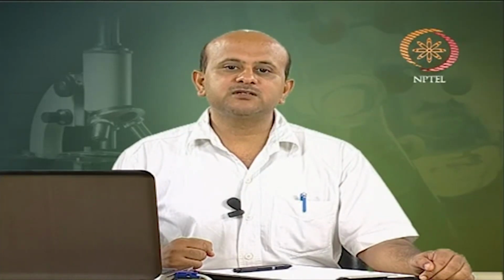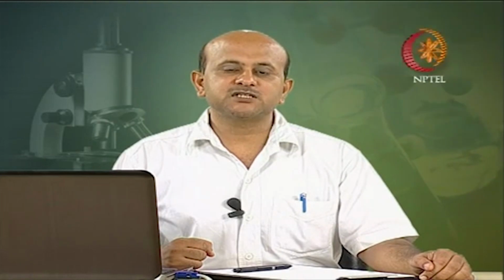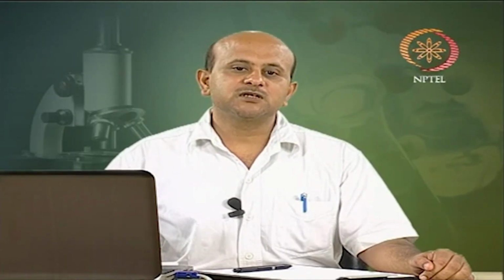The sample is first placed onto a probe and then inserted into the ionization region of the mass spectrometer, typically through a vacuum interlock. The sample is then subjected to any number of desorption processes, such as laser desorption or direct heating, to facilitate ionization or vaporization.